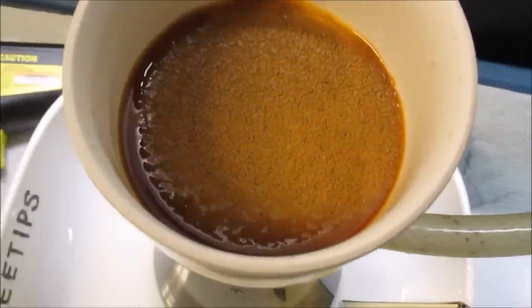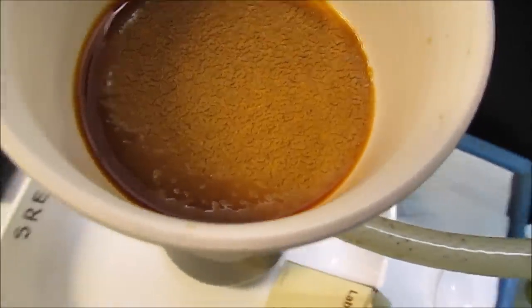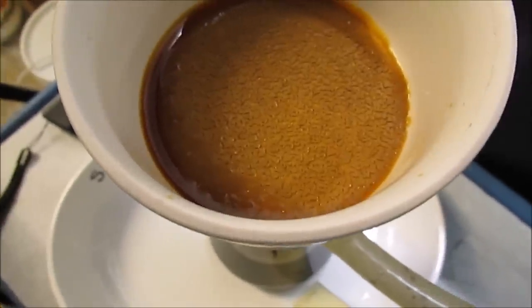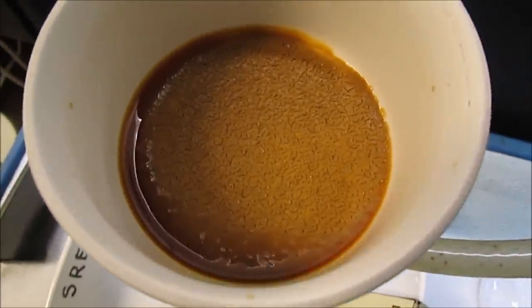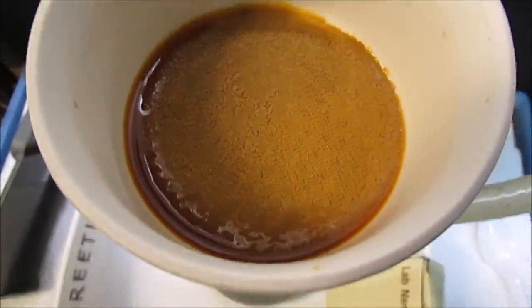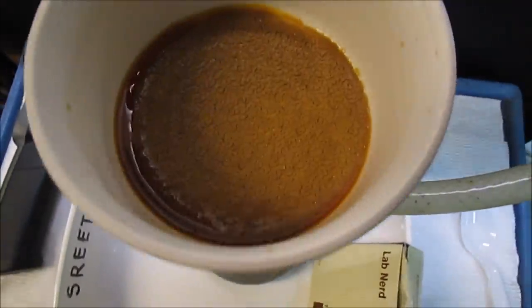My mixed PGM solution is almost completely filtered now. And here's something I didn't expect — I got some solids in the filter. Don't know what that is. Didn't expect much to be in with the dissolved mixed PGMs, but obviously I got something. So I'm glad I filtered it out.